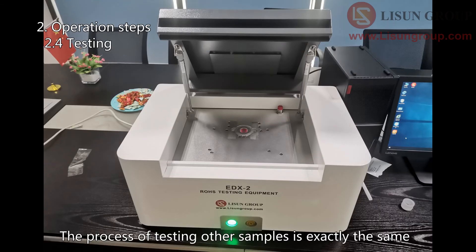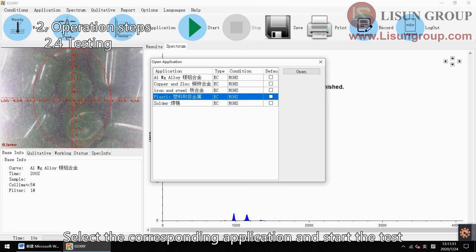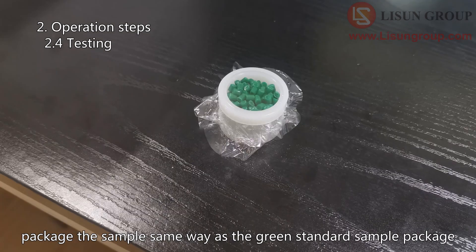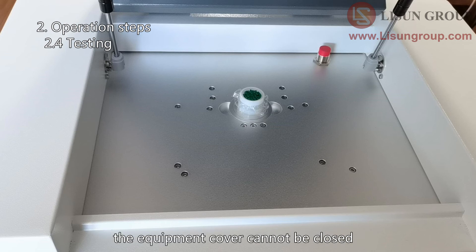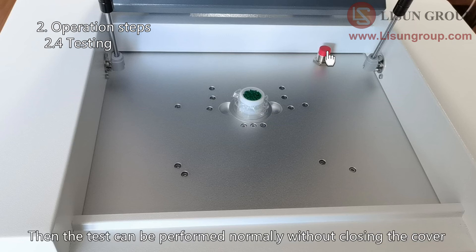The process of testing other samples is exactly the same as the process of testing the standard sample package. Put the sample into the test position of the equipment, select the corresponding application, and start the test. If the sample is particles or liquid, please use the sample cup and test film to package the sample the same way as the green standard sample package. Please note that if the sample is too big and the equipment cover cannot be closed, you can put a coin on the sensor switch — then the test can be performed normally without closing the cover.